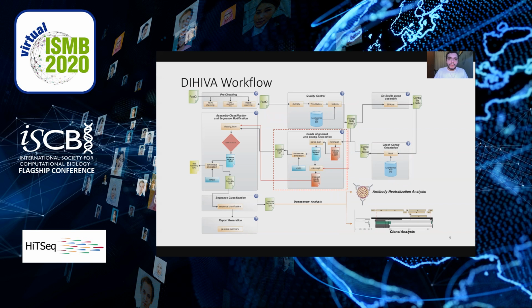In step 4, we use our in-house Perl scripts that export a consensus sequence based on the modification of the draft genome by the mapping of the high quality reads to it. We also have another Perl script that exports a GenBank file that represents the annotation of the consensus sequence. And at the end of step 4, we also have the BAM file that represents the mapping of the high quality reads to the consensus sequence.